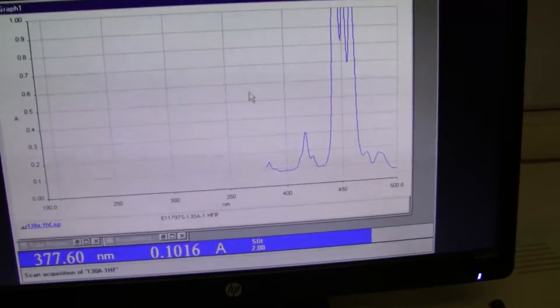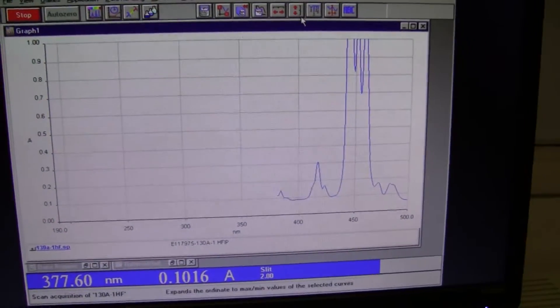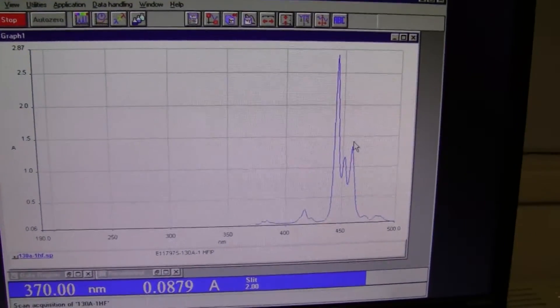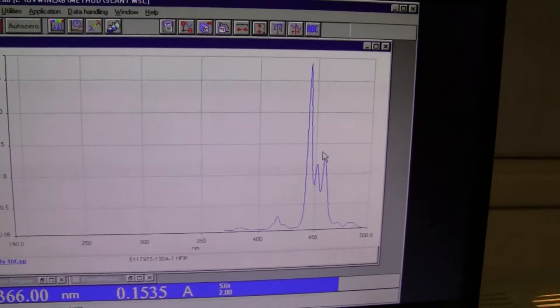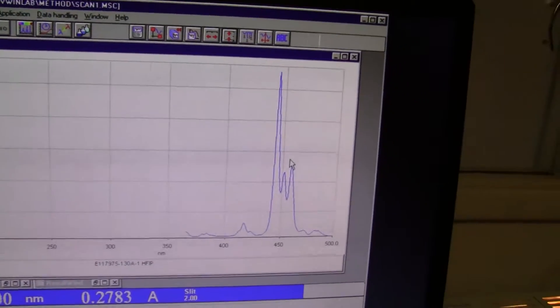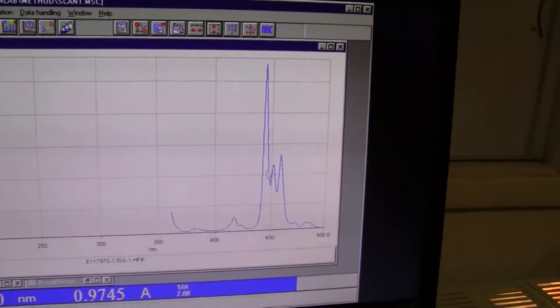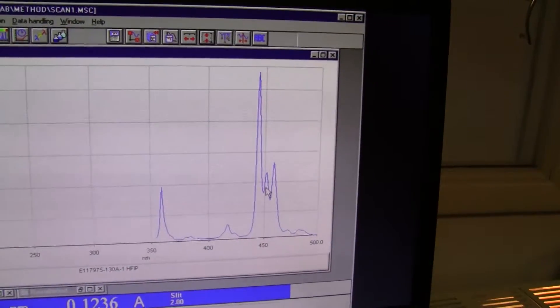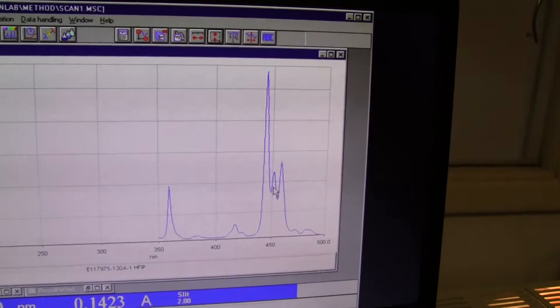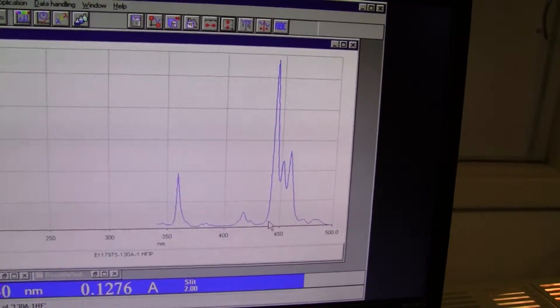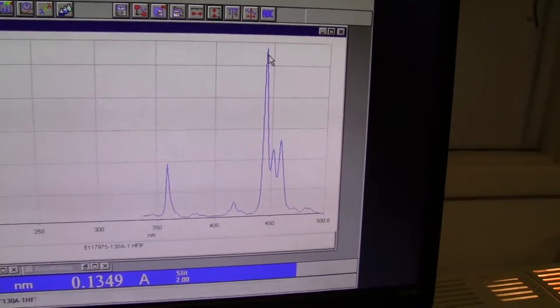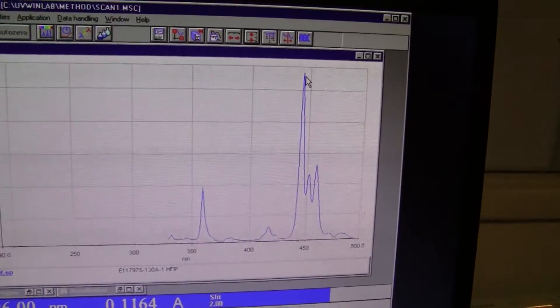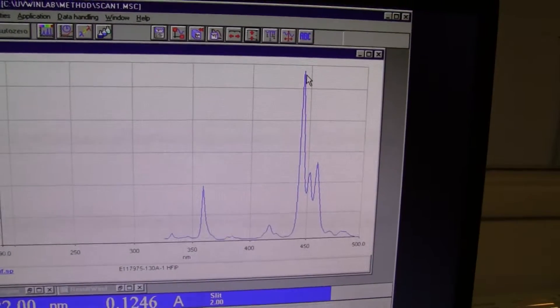I'll adjust so we can see some peaks. Right here you can see the traditional holmium standard peaks, which indicates the unit is working as expected. This is around, I would estimate, the 446 range.